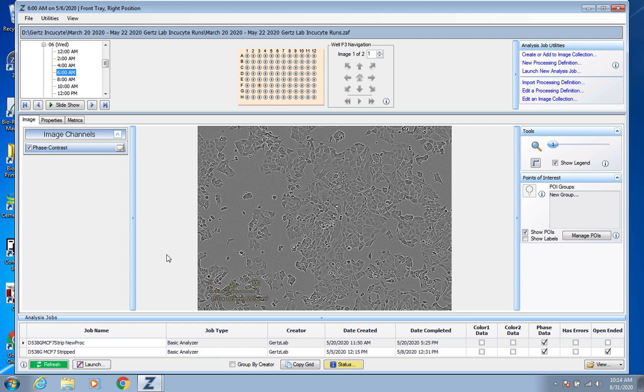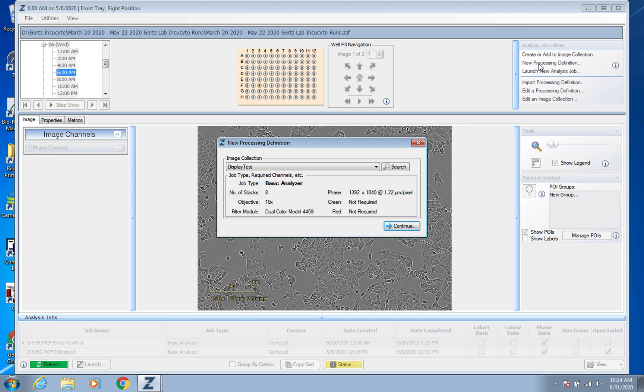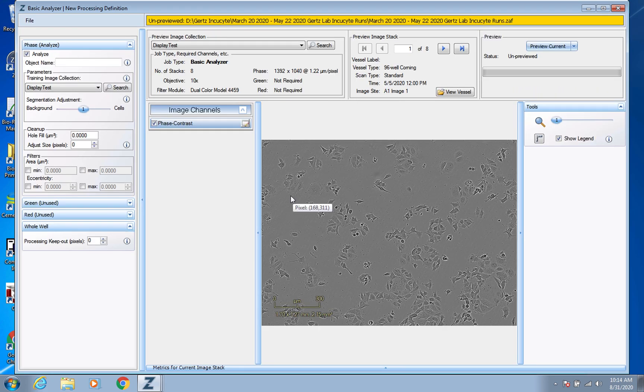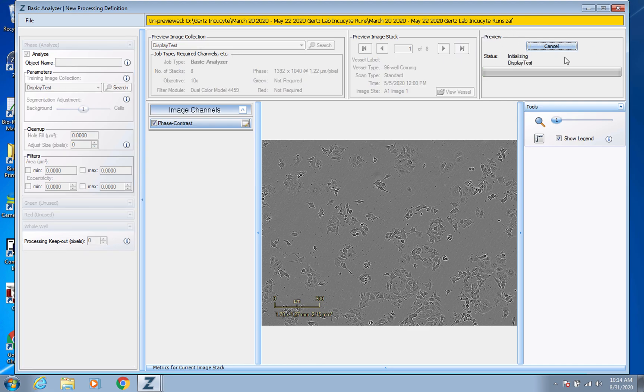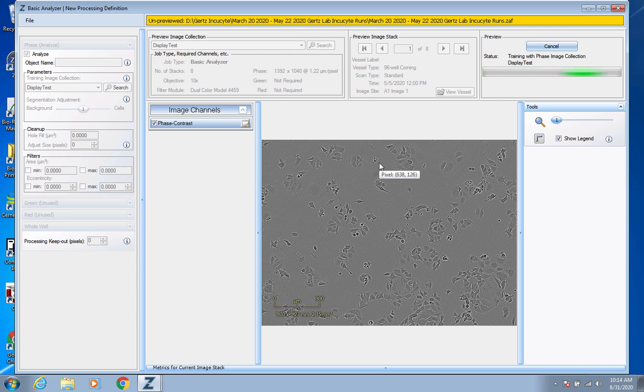So in order to do that, we're, again, top right, new processing definition, and we're going to tell it which image collection we want. The one we just made. And press continue. And so what you want to do first is go up to this top right, and you'll see preview, and do preview all. So right now, you can see it's training itself on the image collection that we gave it.